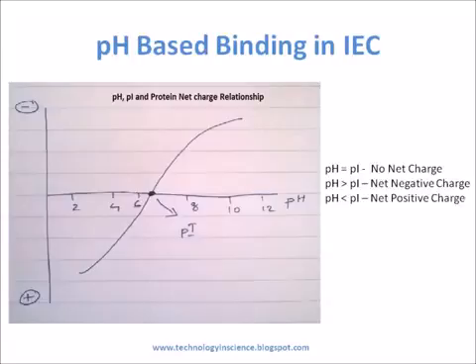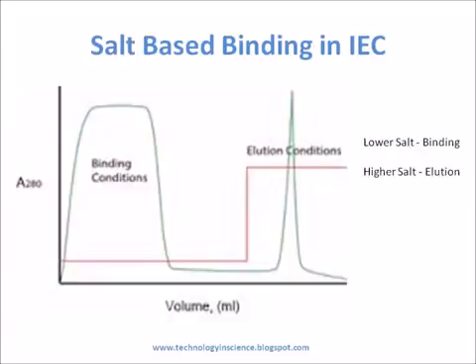Binding to the matrix requires that buffer ions that are bound to the matrix during the equilibration process be displaced by the solutes of interest. Thus, exchange of ions takes place at the surface of the matrix. On applying the sample, conditions are chosen so that as many as possible of the unwanted solutes do not bind to the resin, leaving the molecules of interest bound to the matrix.